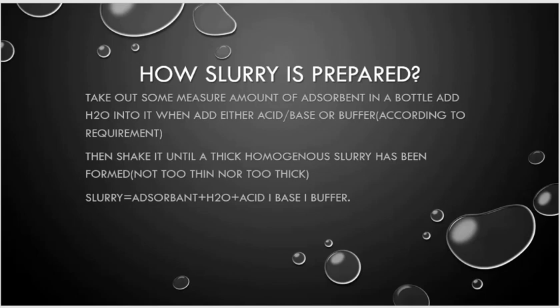The slurry is formed of any adsorbent, water and acid, or base or buffer. This is the preparation of slurry for our TLC plate. The more perfect the slurry is, the more perfect the result will be.